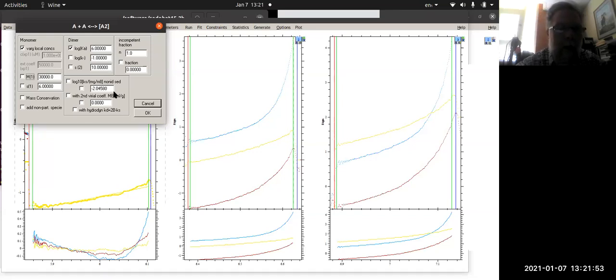A lot of these other things are generally not worth your time trying to mess with. It deals with a lot of non-idealities, and if you set the experiment up correctly, you have a better chance of actually not having to worry about that. I would encourage most people to try to turn on mass conservation. Mass conservation puts a very strict constraint on how well the data fits, and it means that you shouldn't be creating signal from or losing signal to one place or the other.